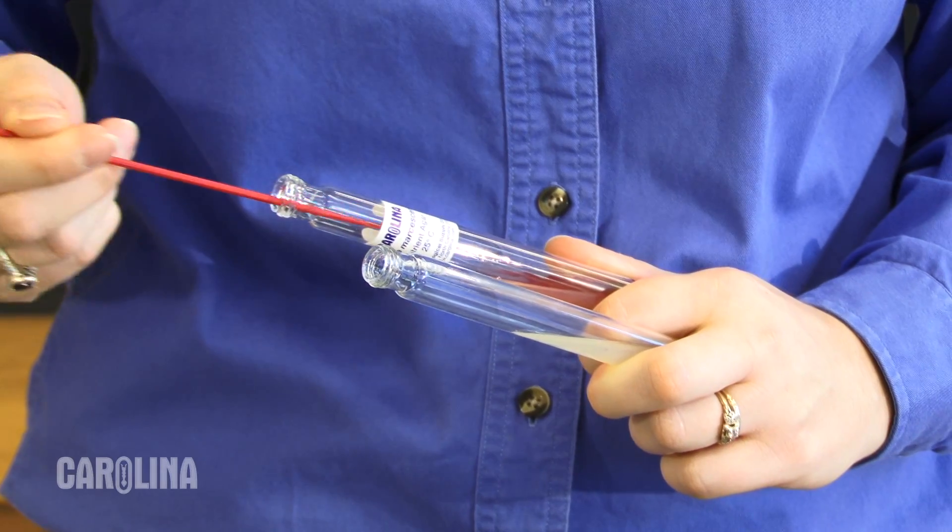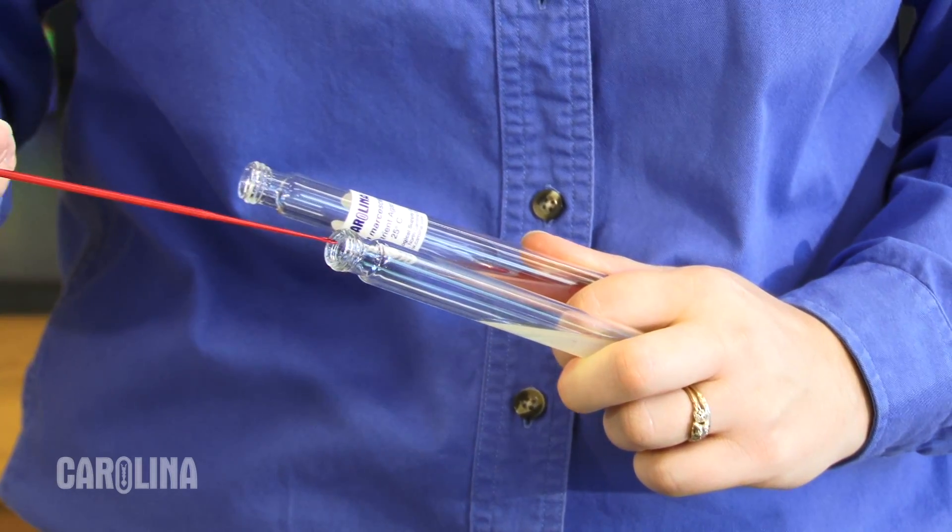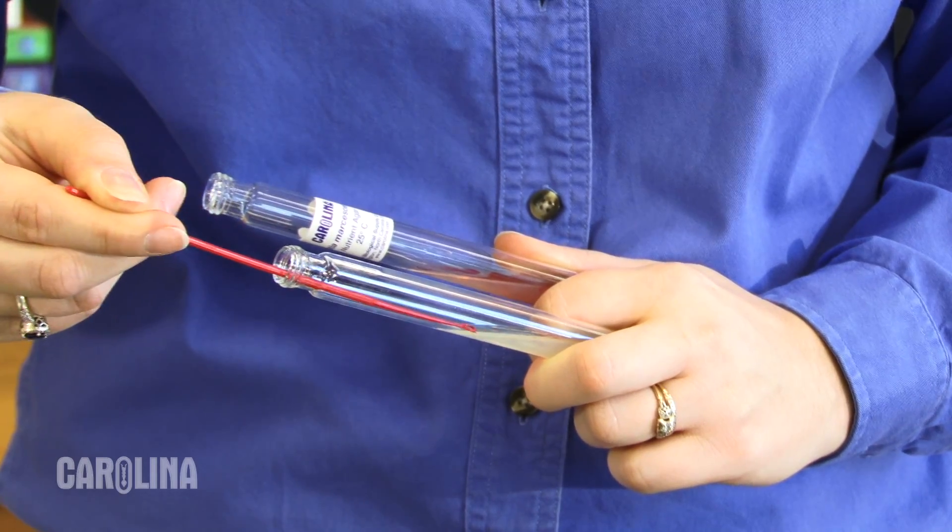Agar slants are smaller versions of a plate culture. As before, use an inoculating loop or swab to remove the bacteria for use.